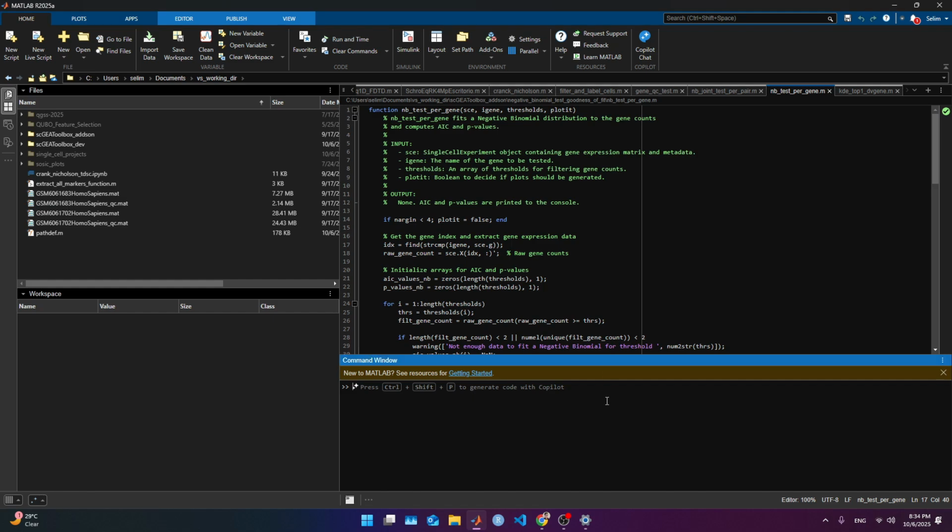Today I want to do a showcase of exploring the data, looking at gene expression and things like that. So far, what we are going to use today is the same data set we've been working on, but this is going to be more hands-on rather than a click button tutorial. So the hands-on is going to be like this.